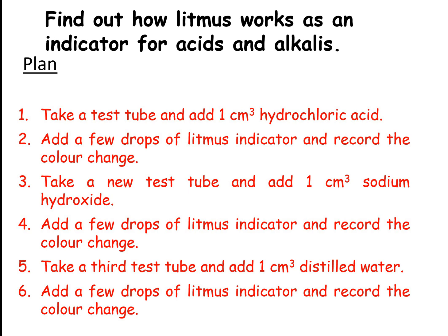Now, hopefully you've done an even better job than me and used time connectives in your plan. That would be brilliant. If you've done it as a paragraph, that is okay, as long as it is clear. Normally we would say a method should be in bullet points or numbered steps. So as long as you've got some key steps, or you said to use a known acid or a known alkali, if you couldn't remember the name of one, that is also okay.